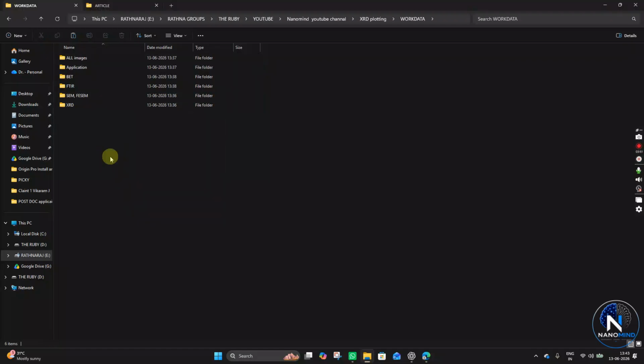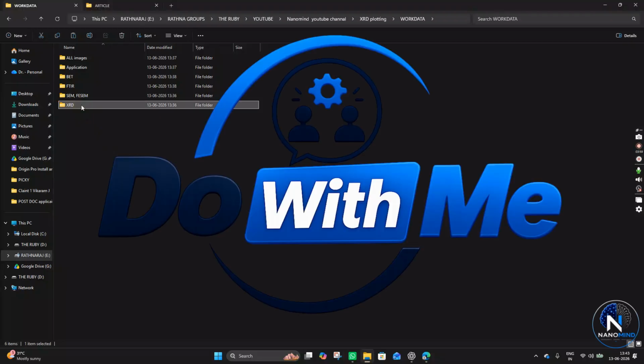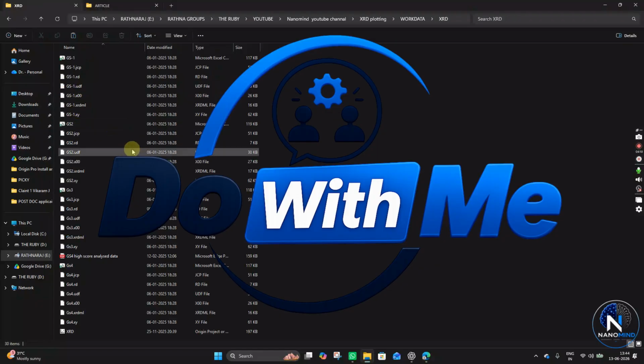Here today I'm going to take XRD as an example. Using this XRD data, I'm going to tell you the tips and tricks, what things you must not do, and what is enough to do to plot the XRD data. Okay, so now coming to the XRD, here I have some XRD related files: GS1, GS2, GS3 and GS4. There are 4 files.